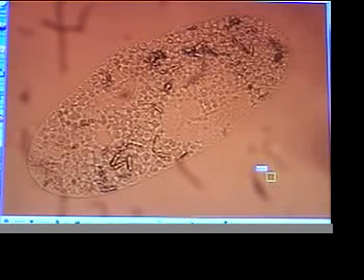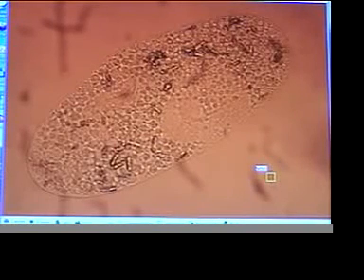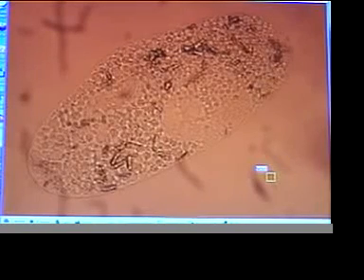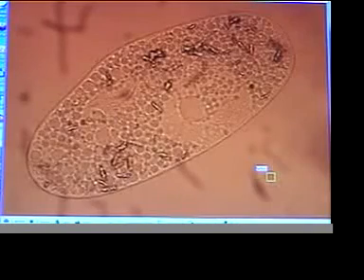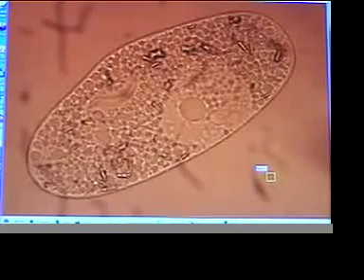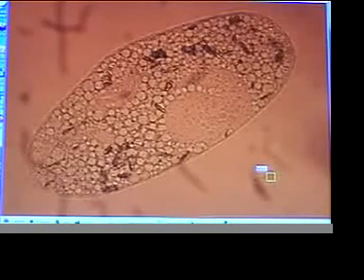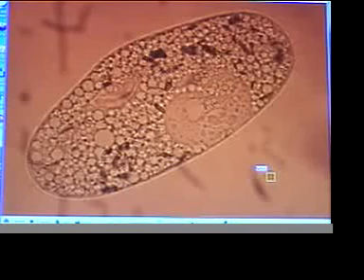So this is about 10 minutes, 635 seconds, with a sine wave 1178. There's still some motion. There's an actual contraction there. I'm changing the focus a little bit on the microscope.